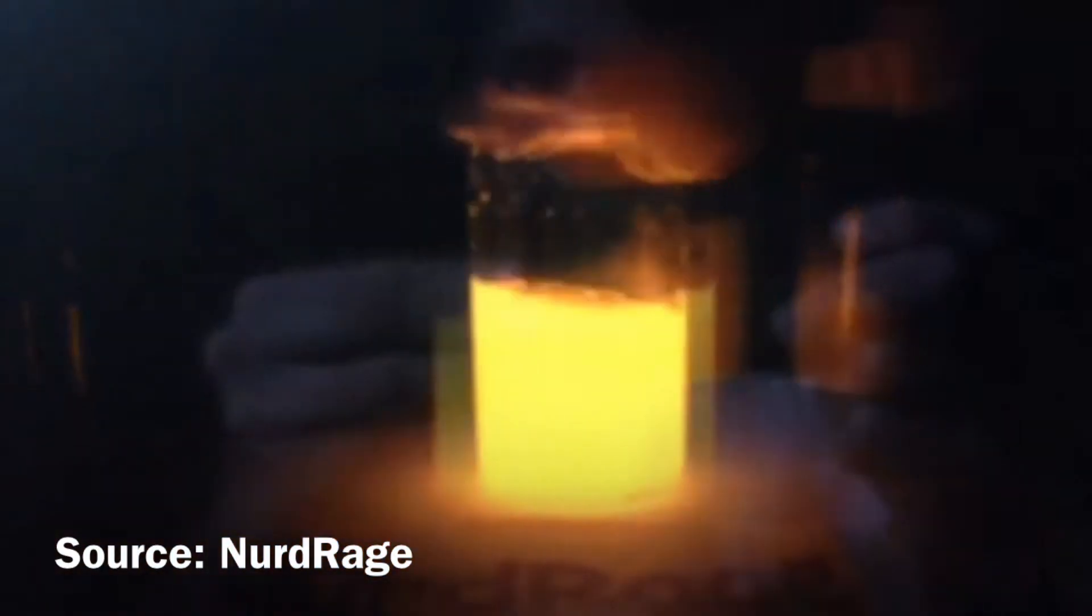Hello everyone and welcome back to the lab. In this video I'll be making diethyl phthalate. This chemical is used as a solvent in glow sticks.